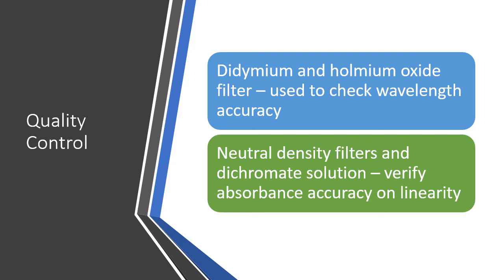Okay, so that's the end of our final term. Again, this spectrophotometer is going to be studied more in your clinical chemistry, but hopefully this offers a bit of introduction para pagdating dun sa clinical chemistry, hindi na kayo masyadong mabigla. Okay, you're going to study more light sources, you're going to study more photodetectors, monochromators, you're going to study more different types of spectrophotometers. But this time, general lang muna tayo. Okay? So, thank you so much for listening and I hope you learned something new.